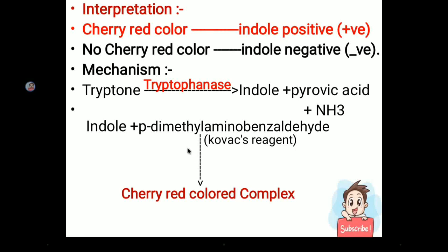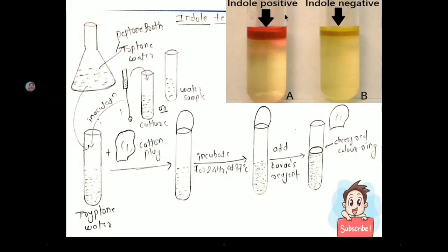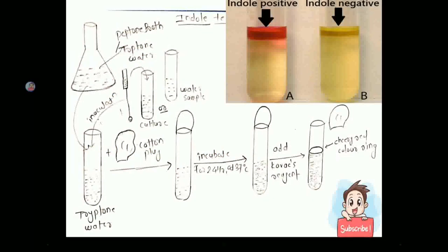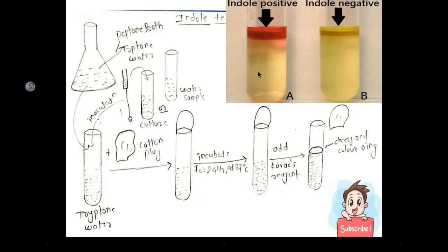Sometimes the cherry red color forms not at the surface but at an intermediate position in the test tube. This can occur when the apparatus is not properly washed. To avoid this intermediate result, we add Ether or xylene reagent, which extracts more indole to the upper surface, preventing intermediate ring formation.